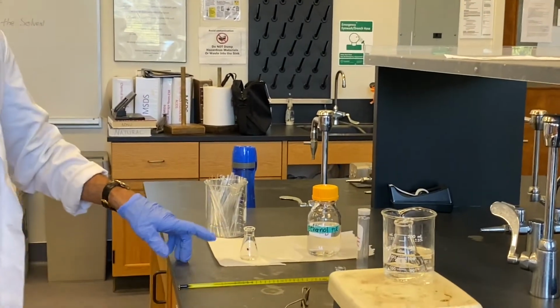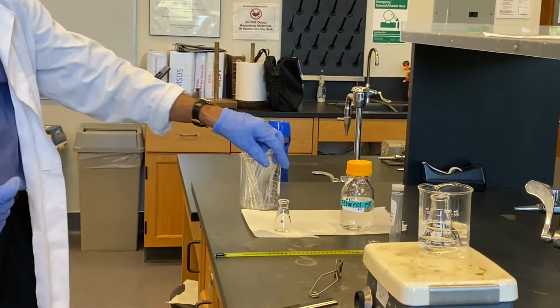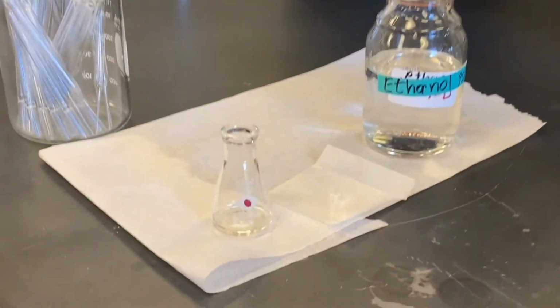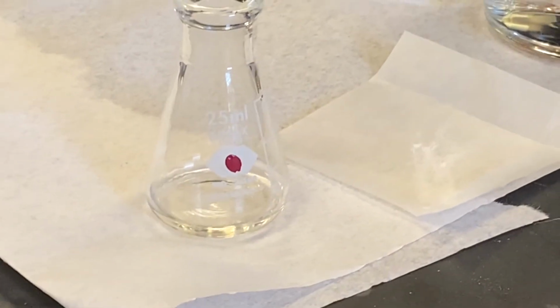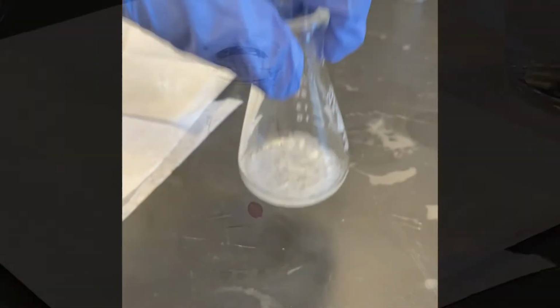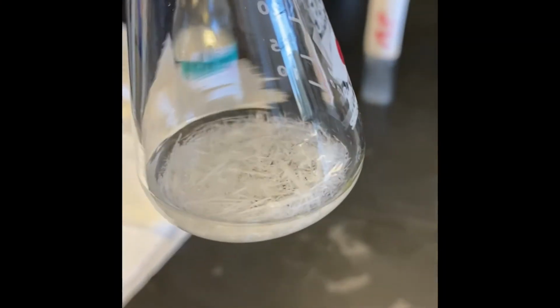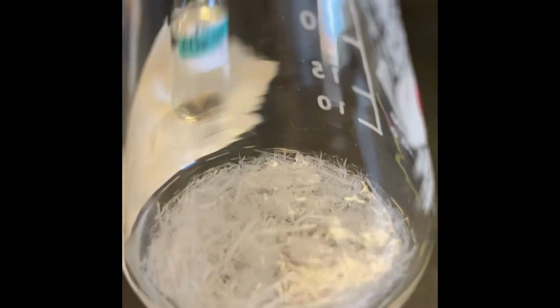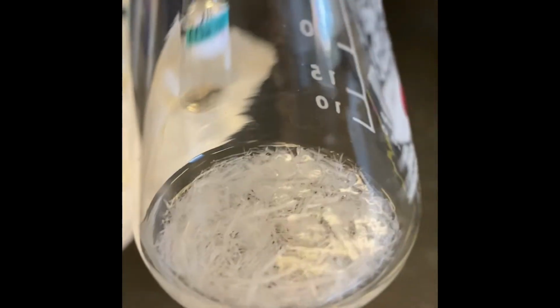So when it crystallizes, you don't want to touch it. The reason is you don't want to disturb the crystals. So it will crystallize by itself as it cools down. Hopefully. See here, the crystals are forming. Already it's beautiful, it's so quick. It's not even room temperature yet.